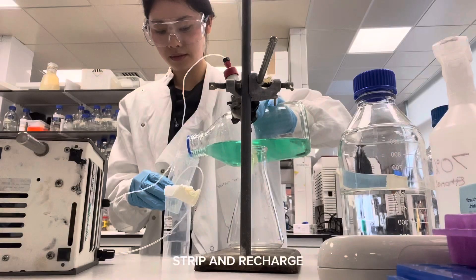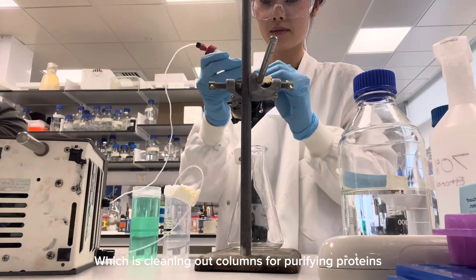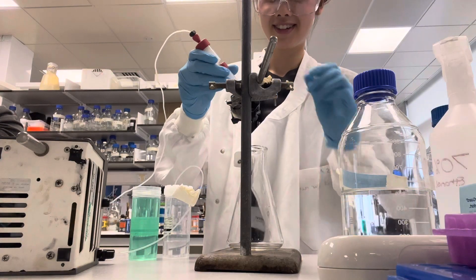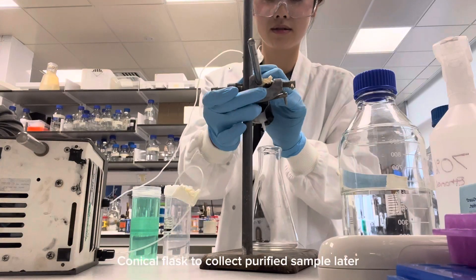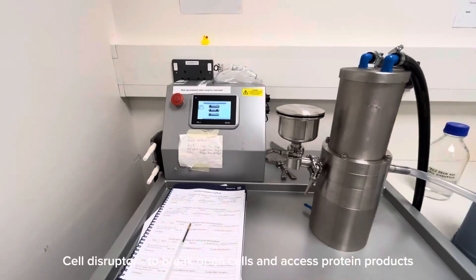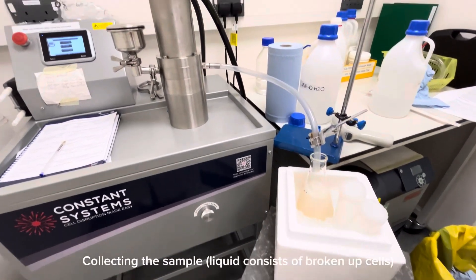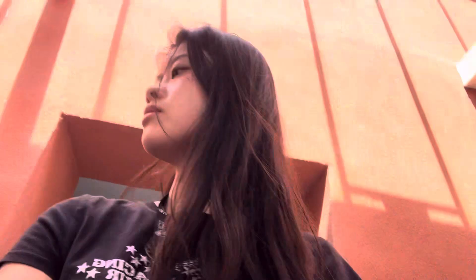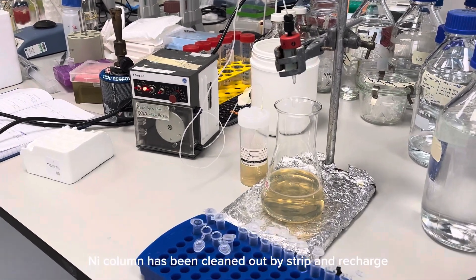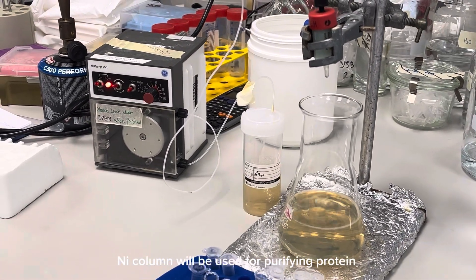What I'm doing here is a step called strip and recharge, which is in preparation for protein purification. The nickel column has been cleaned out by the strip and recharge steps, and I'm using it for the second round of protein purification.